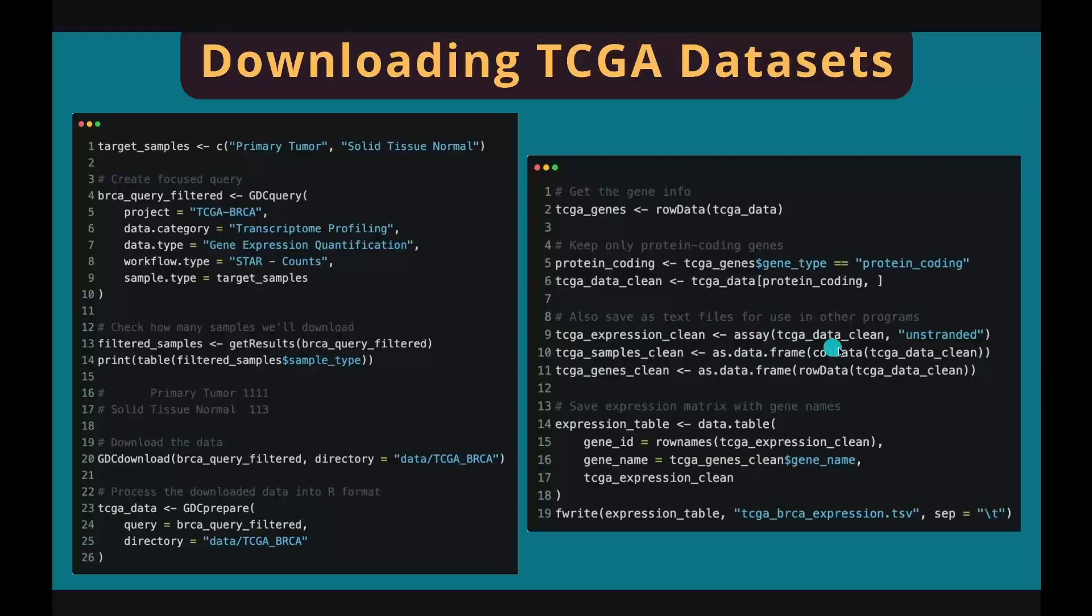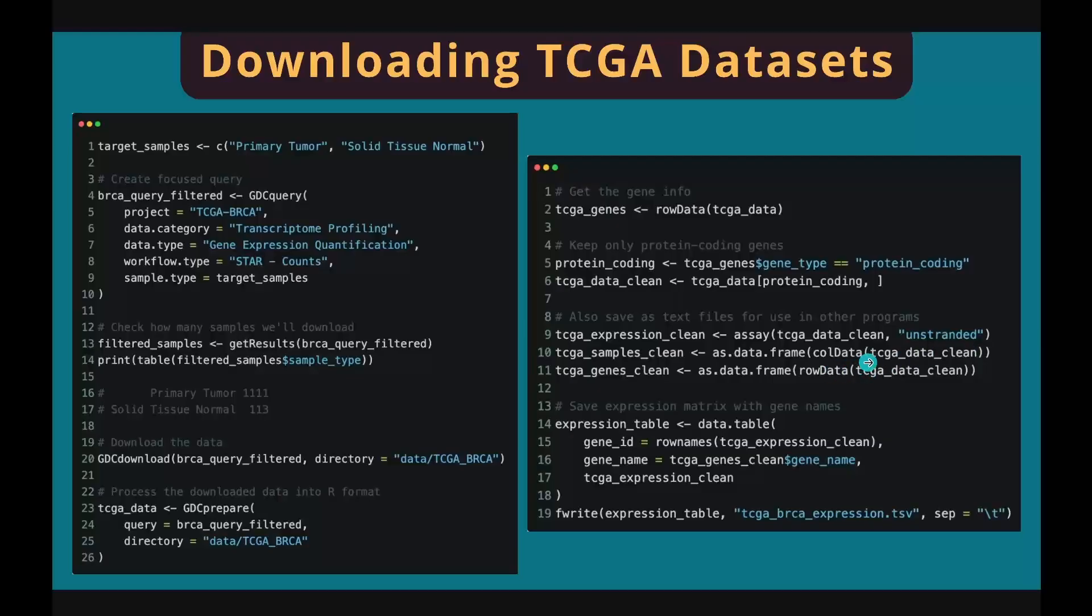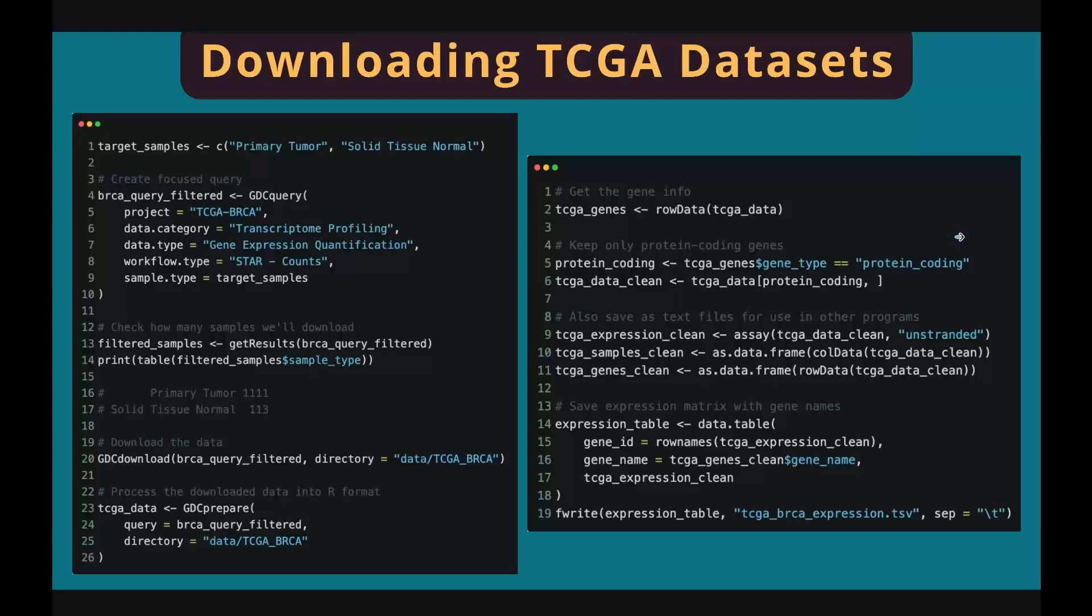Let me show you how to extract information from TCGA data object. We use assay function to extract gene expression matrix. Make sure to specify the unstranded argument because we don't care about unstrandedness for gene expression. Using colData to extract sample information. Using rowData function to extract gene information. You can choose to keep protein coding genes only in your expression data as demonstrated here, but you don't have to.